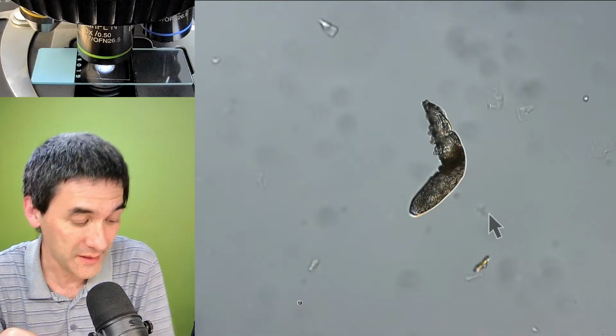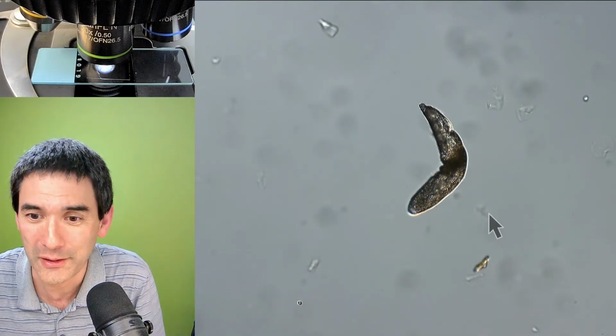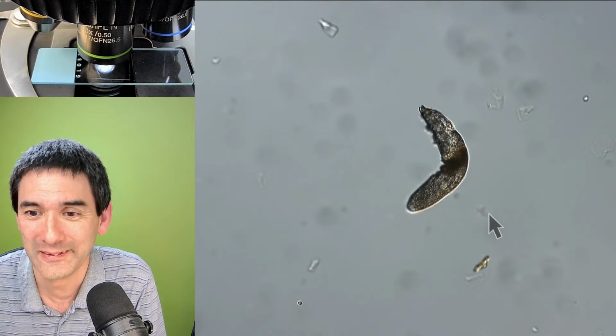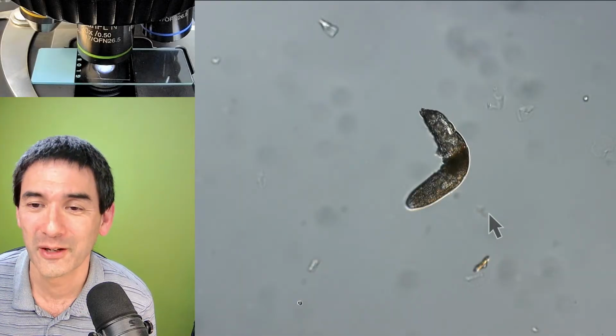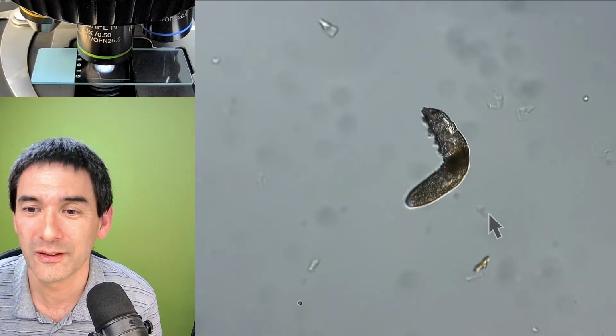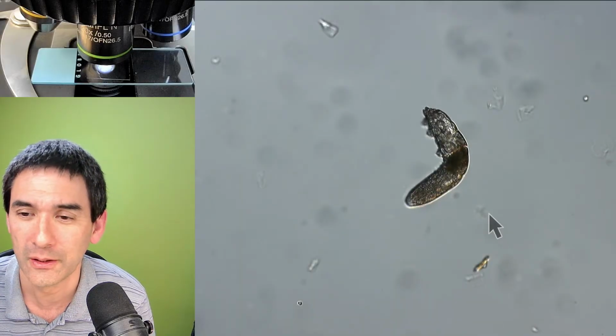And then what happens to them when they die? I mean, I guess they're kind of reabsorbed again back into our body. So I'm quickly reading it again. Typical 14 days.